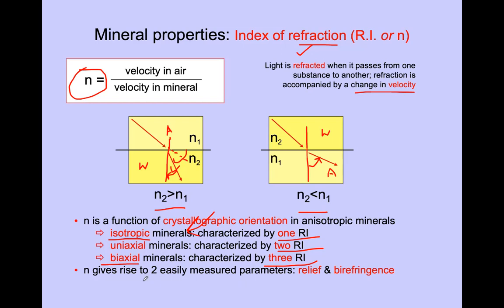You are not going to have complications, but you will observe some different minerals. To determine this refractive index, there is a complicated procedure utilized with the optical microscope, called the optic figure. That is mostly used just by mineralogists.